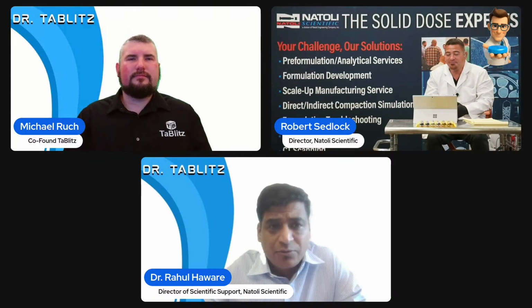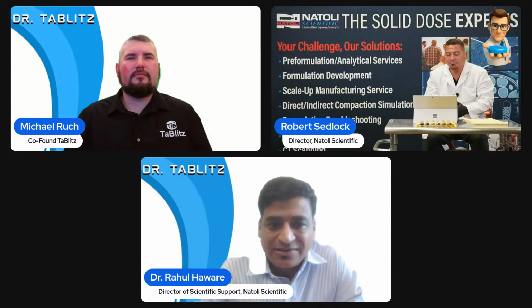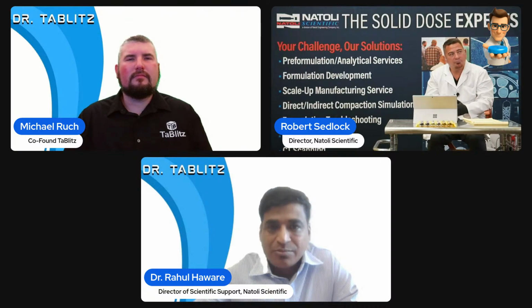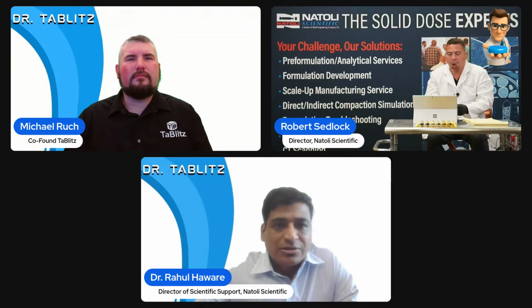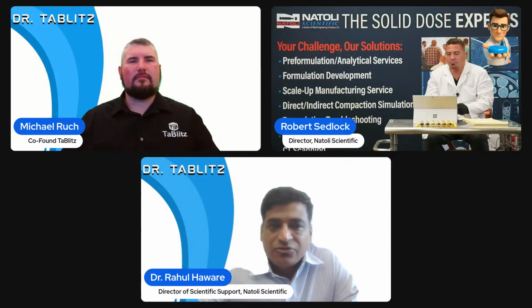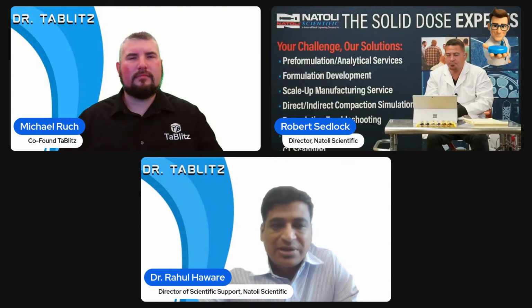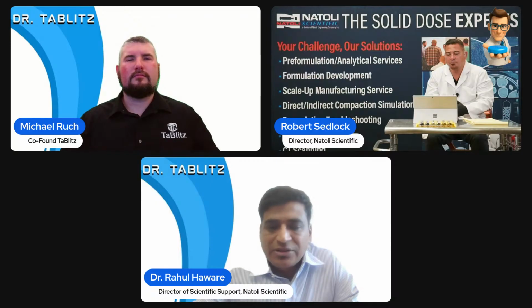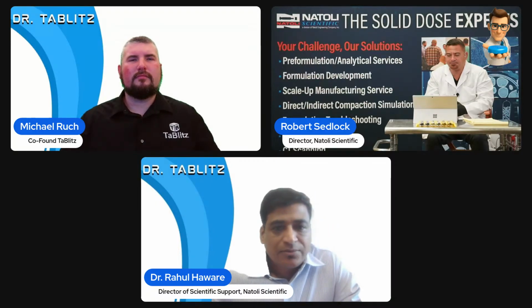So here today we are gonna talk about how we can assess the powder flow of challenging powders when traditional methodologies like Hausner ratio and compressibility index don't help us to distinguish the powder properties. So that's what Robert was doing. He was using advanced characterization tool FT4 Rheometer, and I'm gonna go through the details of that methodology.